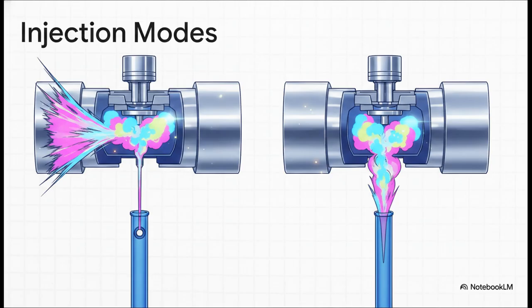In this setup, only a tiny fraction of the vapor actually enters the column, and the rest is vented away so we don't totally overwhelm the system. But remember our apple? We're hunting for incredibly faint trace pesticide residues, meaning our concentrations are well below 0.001%. So for this, we use splitless mode. The vent stays closed for a specific window of time, sweeping the entire tiny sample into the column. We literally can't afford to lose a single precious molecule.